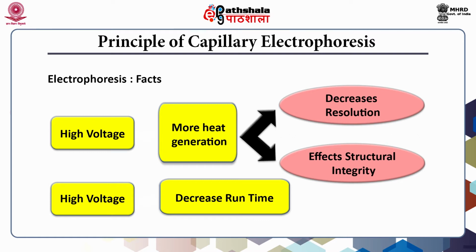During the performance of different methods of capillary gel electrophoresis, the analyte is separated on the basis of its migration in applied electric field. The main advantage of using capillary electrophoresis over the conventional methods using the slab gel is to overcome the heating effects generated during the electrophoresis.